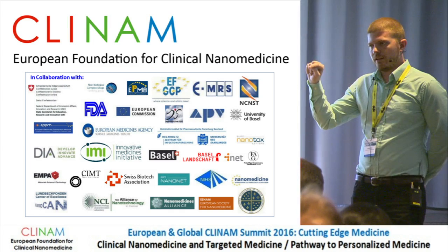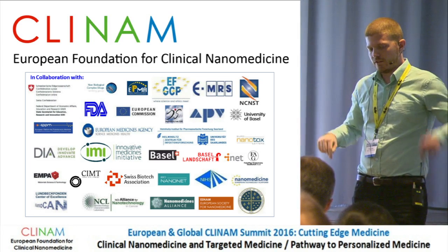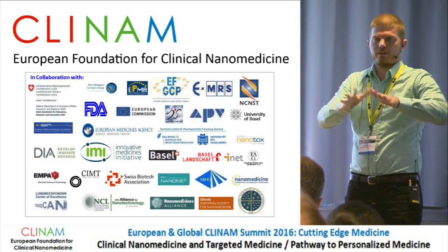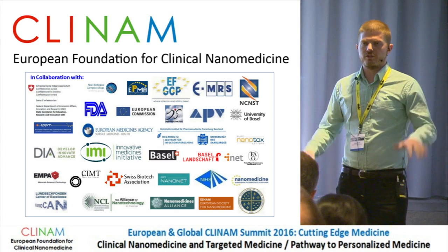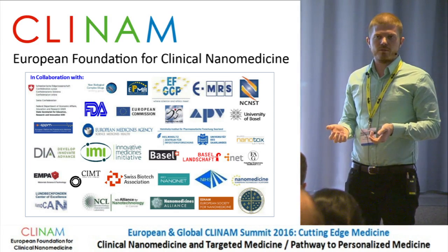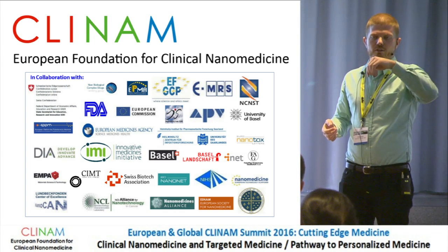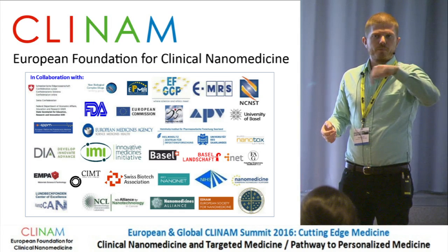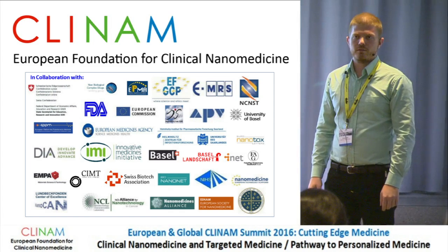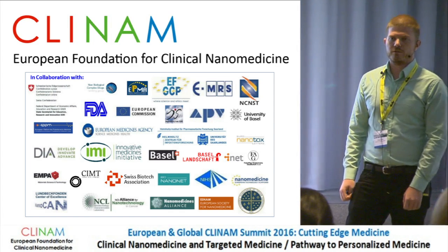This awesome video, yeah. That's not really about measuring the stiffness in this case, but instead you do more lateral movement to see how far the force spreads in the plane. So you see how stiff it is. Because in conventional force mapping you can only measure in this direction, whereas now you can also do what's called friction measurements, and see optically how you pull the things, and from this deduce the stiffness from the optical image.